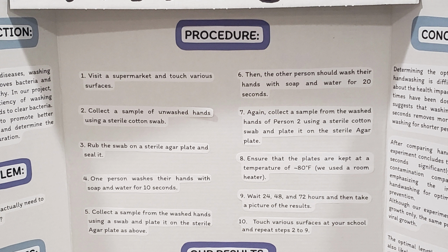Our third step is rubbing the swab on the sterile agar plate and sealing it. One of us washed their hands with soap and water for 10 seconds. We then collected a sample from the washed hands using a swab and plated it on a sterile agar plate.